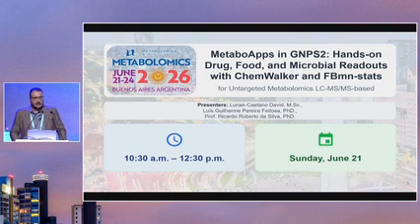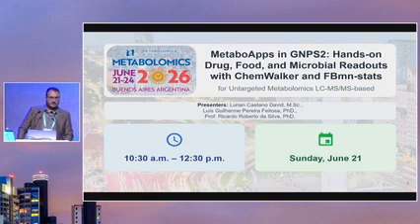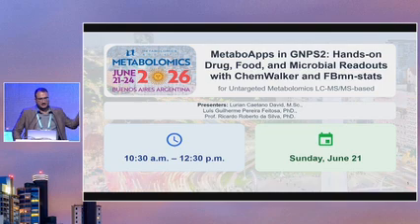But you can ask questions anytime, so it's going to be a little different from the other workshops, because the idea is to be really more dynamic and more interactive instead of just me presenting some slides and the workflows for those tools.